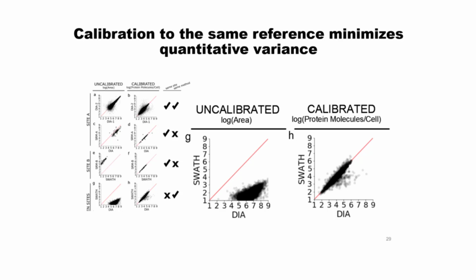In our case, they tend to have their CSF from a healthy pool of middle-aged people, when a lot of the CSF that we're interested in is from elderly populations with Alzheimer's disease or Parkinson's disease. So it's a very huge difference in age effect. So we've made our own common reference from CSF samples that we've collected over time through either our hospital or Stanford's hospital.